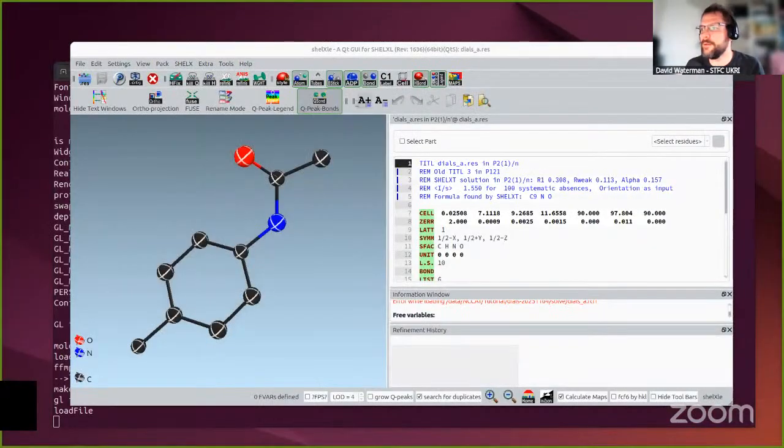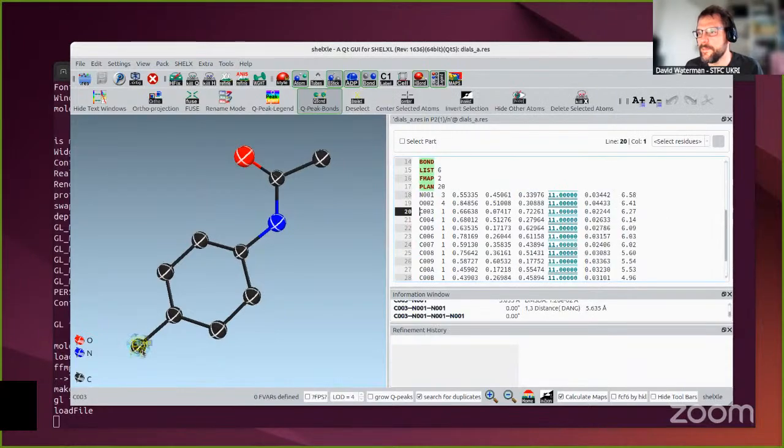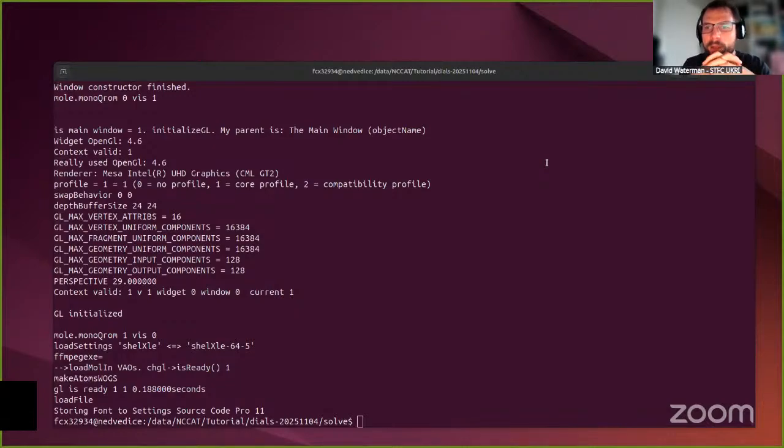So you would have to correct the atom assignments. I guess we need to change that. But anyway, we have successfully solved the structure based on combining the 3 data sets, and the statistics are not too bad after you've trimmed out the bad images.